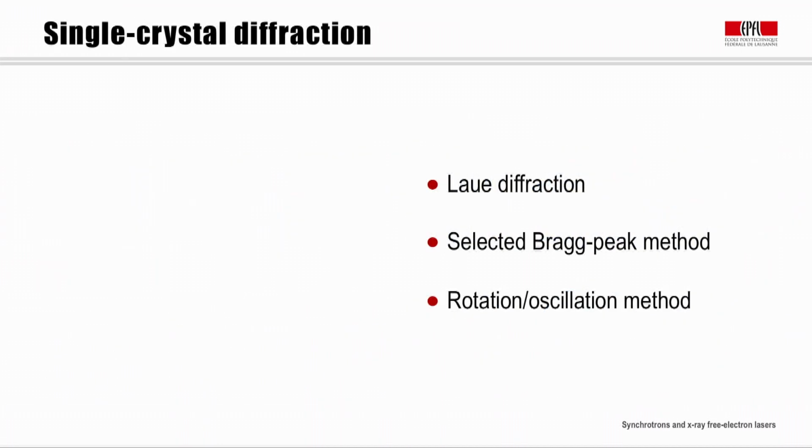Let's begin with three different approaches to studying single crystals. Each method is suited for different applications. Although the majority of X-ray diffraction methods use quasi-monochromatic X-rays and a sample which must be rotated in space in order to satisfy the diffraction condition, it's also possible to record diffraction patterns of stationary single crystals using a broad spectrum of X-rays, a technique known as the Laue method.